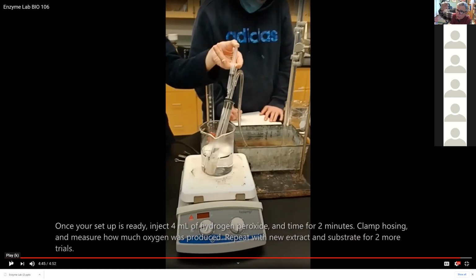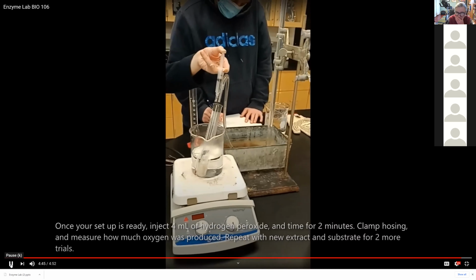You write that down, and you subtract where you started from where you ended. That difference is how much oxygen was produced by this reaction in 2 minutes. And you divide that by 2 to get milliliters of oxygen produced per minute, which you're going to do here.